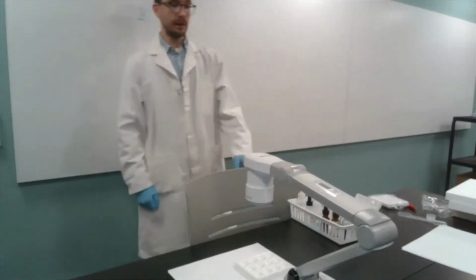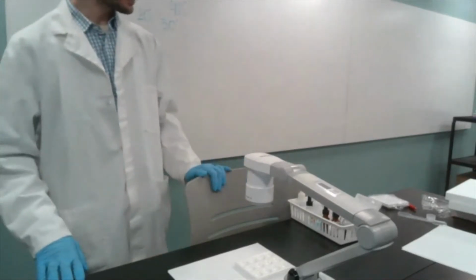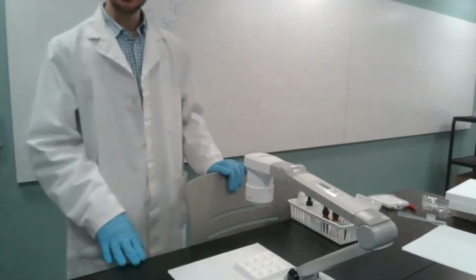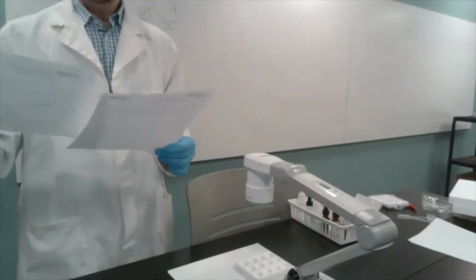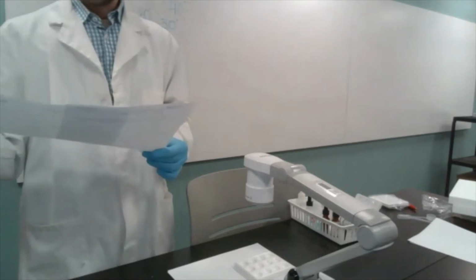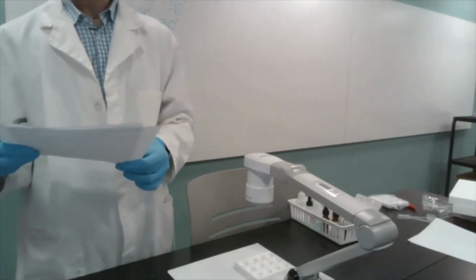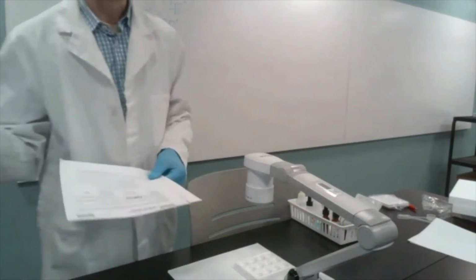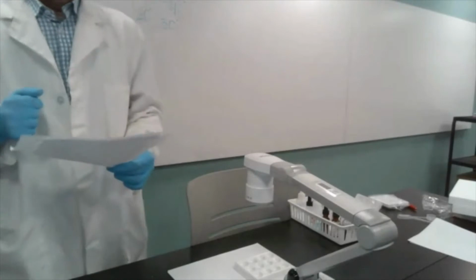I am a lab tech here in the academic upgrading department, and we're doing a lab today. Unfortunately, I don't fit into the frame fully. Today is looking at indicators and how we can use them to help us distinguish acids and bases from neutral solutions. That is, those solutions that are neither acidic nor basic.